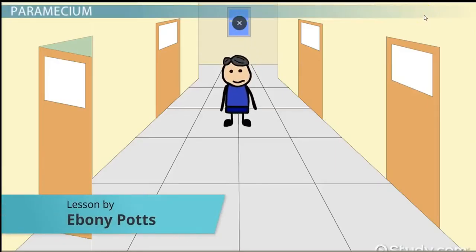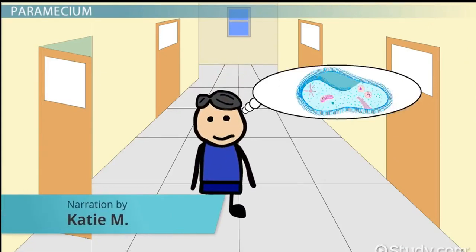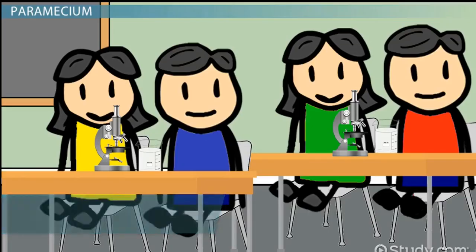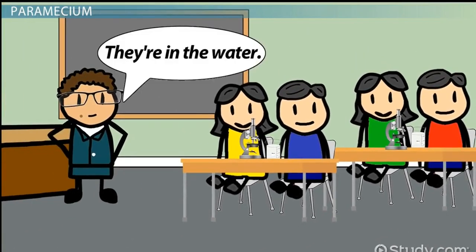You can't wait to get to science class today. Yesterday, Mrs. Chen said that you were going to look at a paramecium under the microscope. When you get to class, you find what looks like beakers of cloudy water on each one of the lab tables. When you ask where the organisms are, Mrs. Chen says that they're in the water.